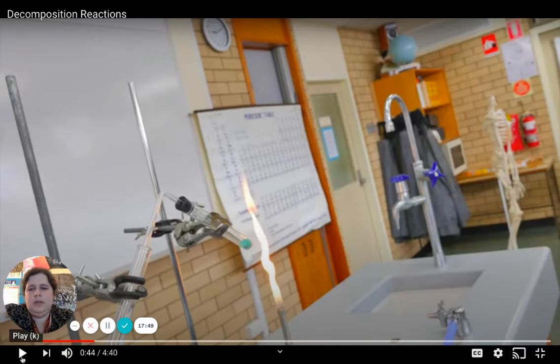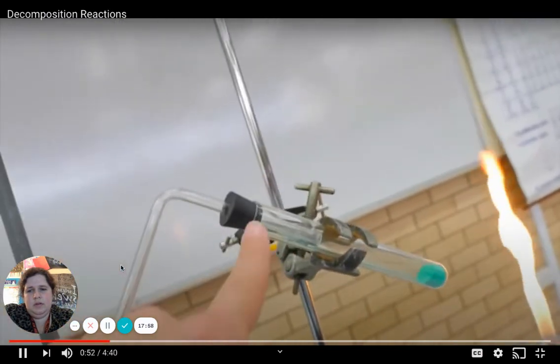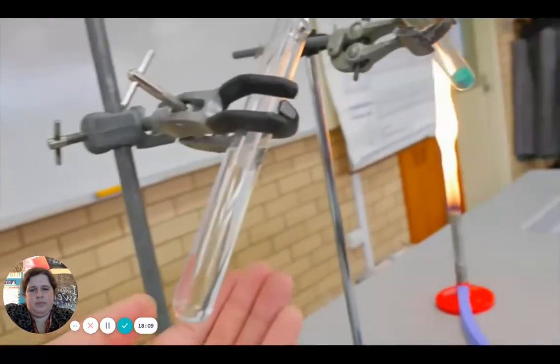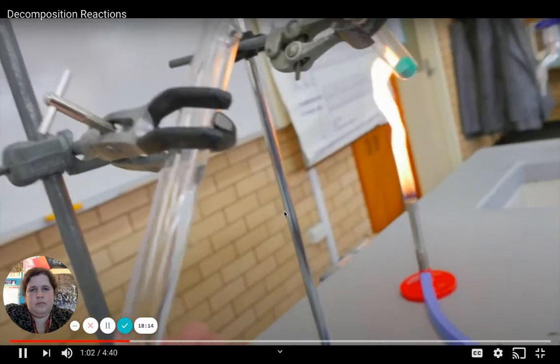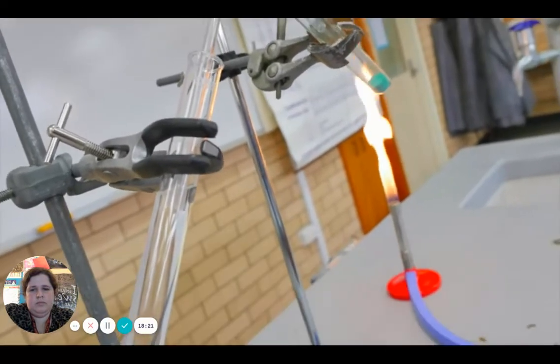So let's see what he says. All right, that's difficult to tell. We can see bubbles, maybe. So here we've got a sealed container. So glass tube, there's a rubber bung, a tube. We usually call that a stopper. That black piece is called a stopper in the U.S. And that goes into some water here. So I can see if there's bubbles being produced, and that might tell me it might be carbon dioxide. But that could be any gas. I could get oxygen gas. I could get carbon dioxide gas. We don't know which one it is.